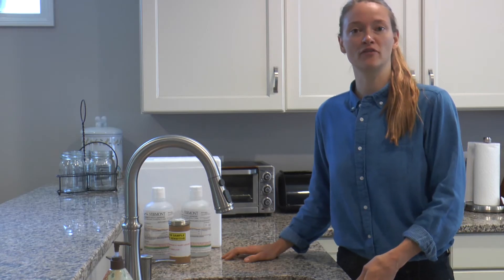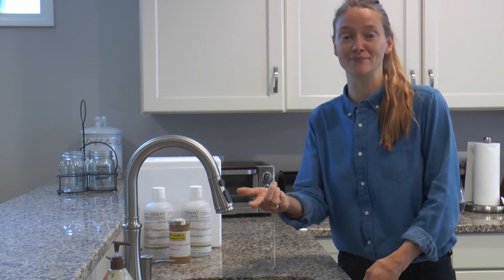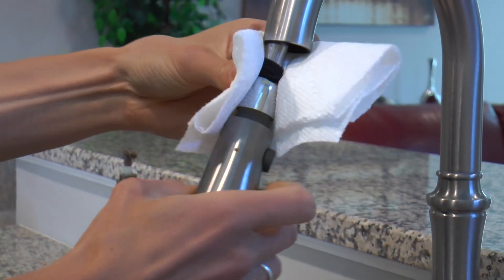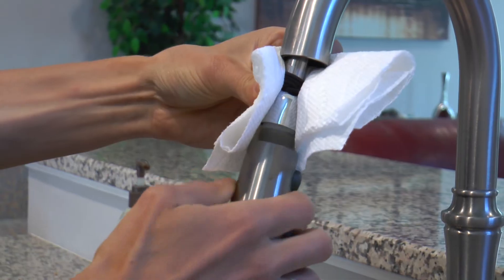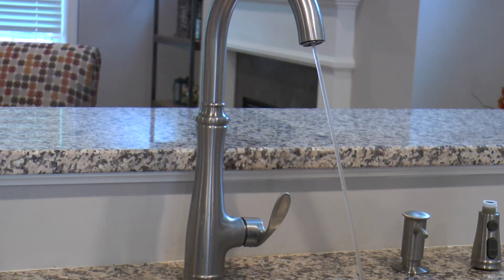You will need to test water from the faucet you use most often for drinking, usually your kitchen tap. Wash your hands, then remove the faucet strainer using a clean paper towel. Turn on the cold water and let it run for three to five minutes at full flow.